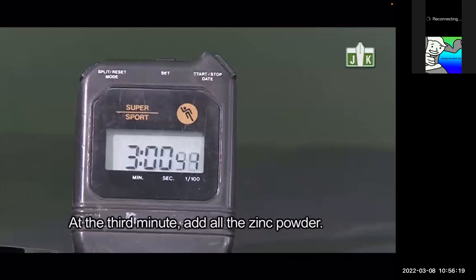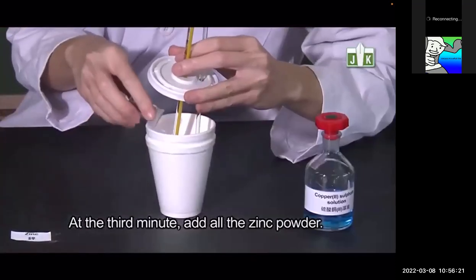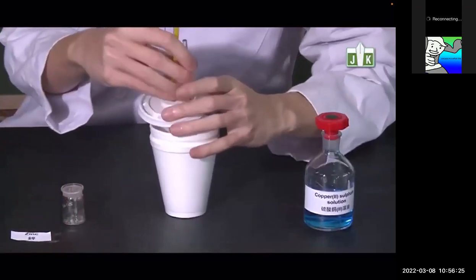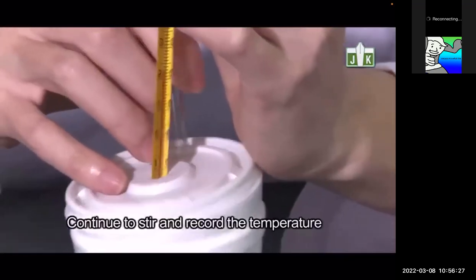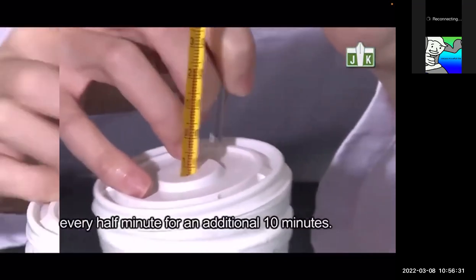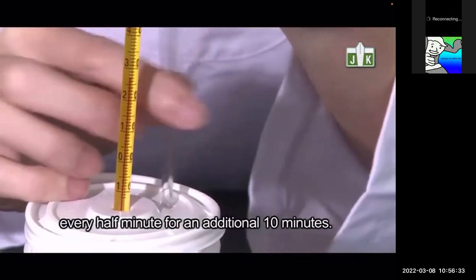At the 3rd minute, add all the zinc powder. Continue to stir and record the temperature every half minute for an additional 10 minutes.